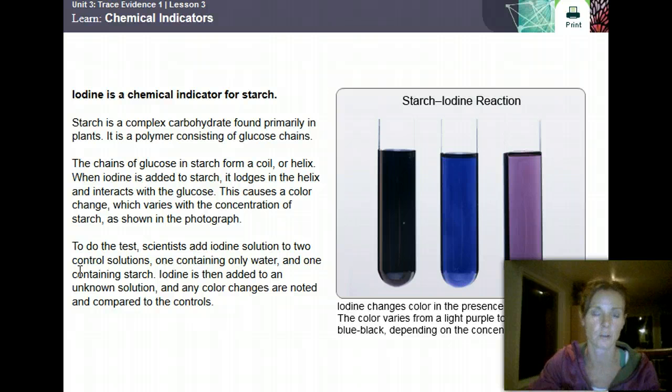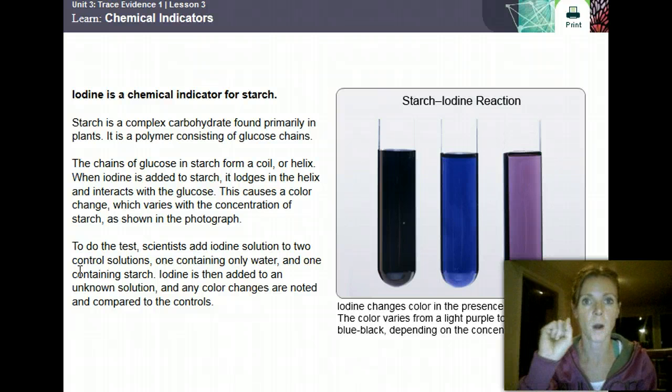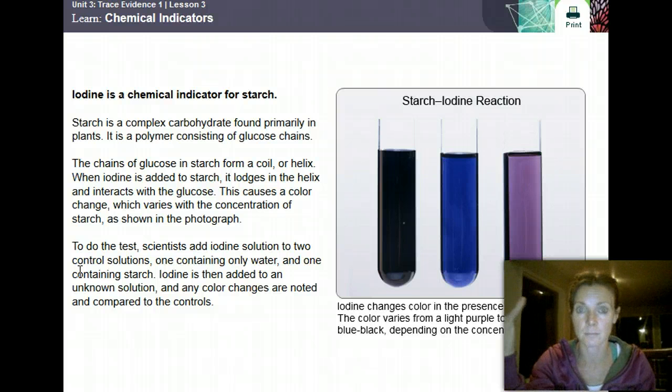Okay, water is always a good control, right? Because we know water is not going to test positive. We know it's going to do nothing. So if you add iodine to water, it's going to turn like a rusty color, okay? So that's a negative test.